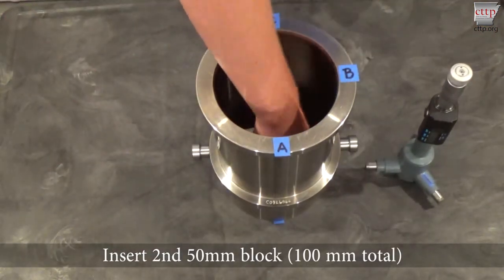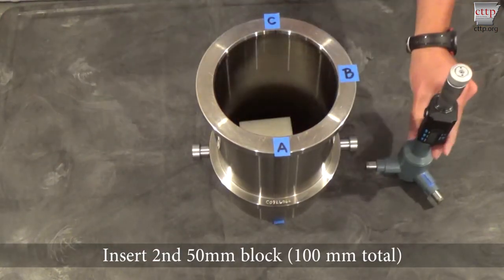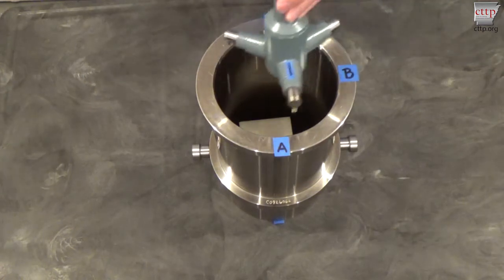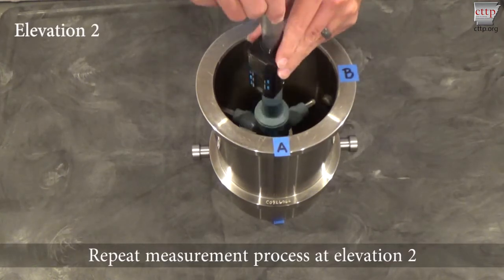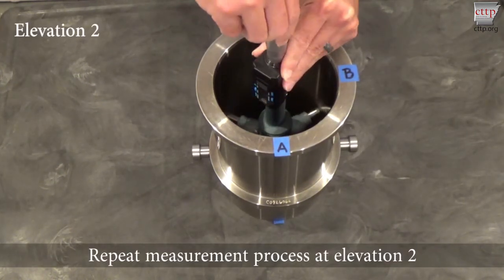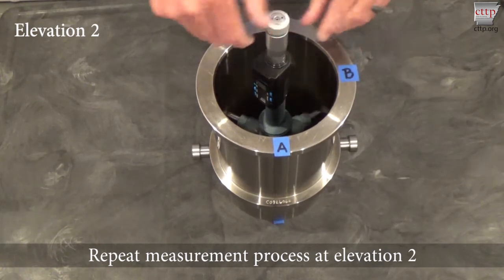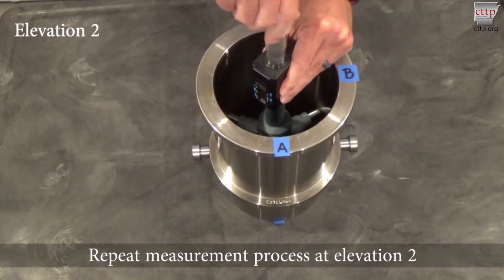Insert the second 50 millimeter block on top of the first block for elevation 2 for a total of 100 millimeters. Insert the bore gauge and repeat the measurement process at positions A, B, and C.